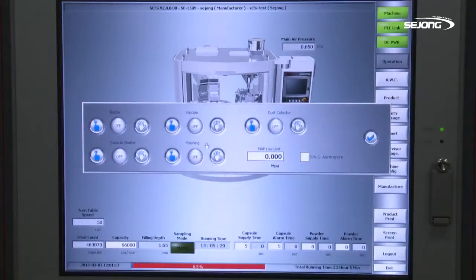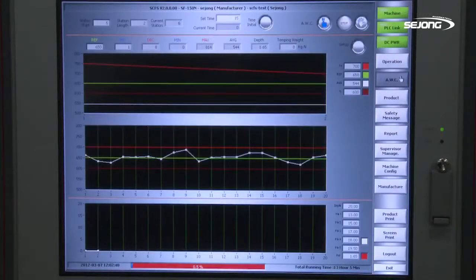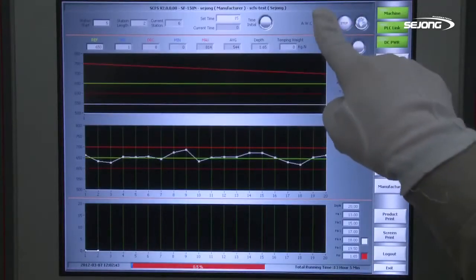Adopting the HMI system as a basic option, it allows you to check all data and working conditions of measured products with the naked eye. You can save all data or print them out with a separate printer.